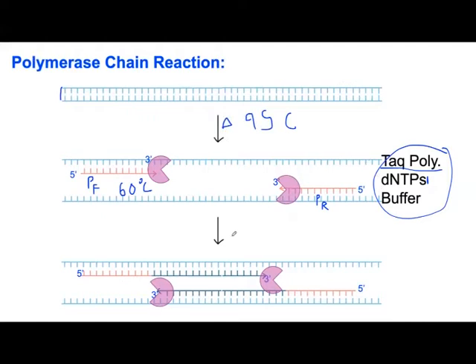And then you're going to do what is called the synthesis. In this synthesis, what happens is the Taq polymerase starts to put, if there is an A here, it puts the T nucleotide here, and then it keeps building from the 3' end of the primer, and it keeps going in this direction.